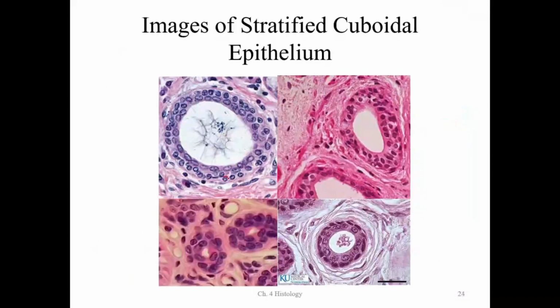So here we have 2 or 3 layers. Free surface is right there. Free surface, 2 or 3 layers.